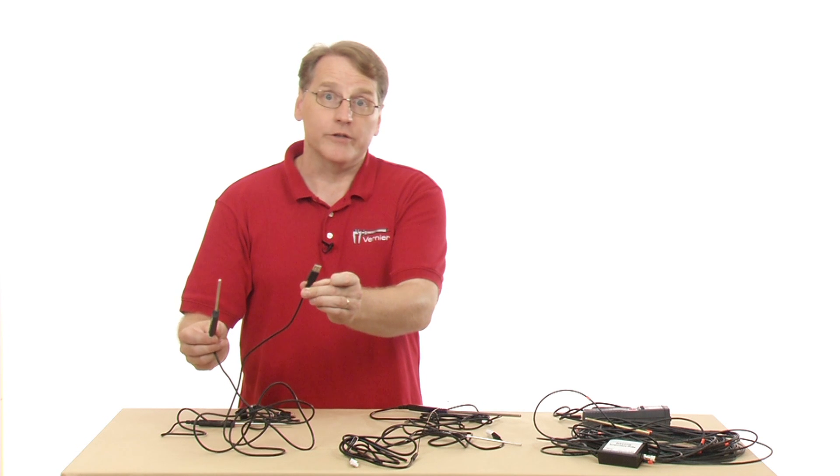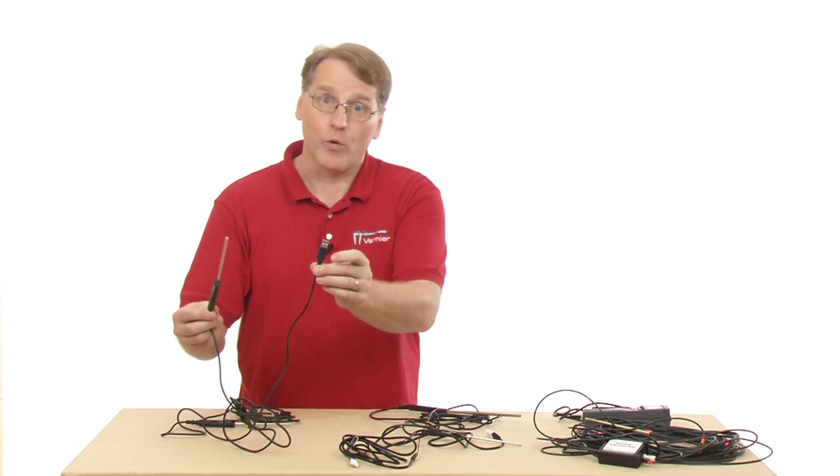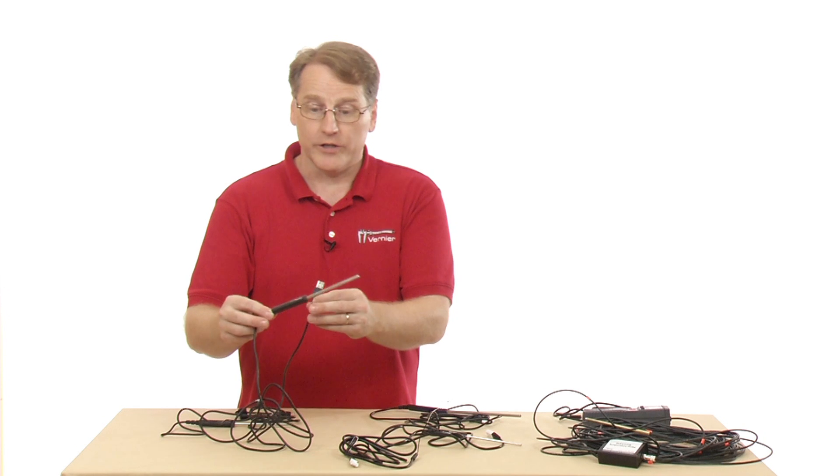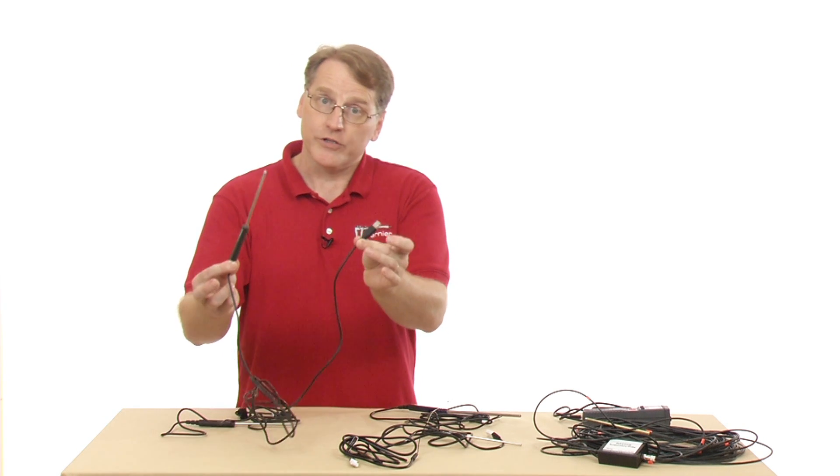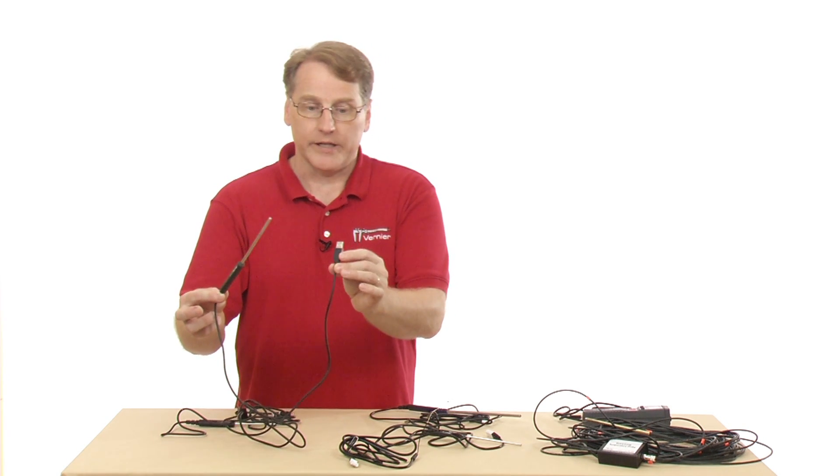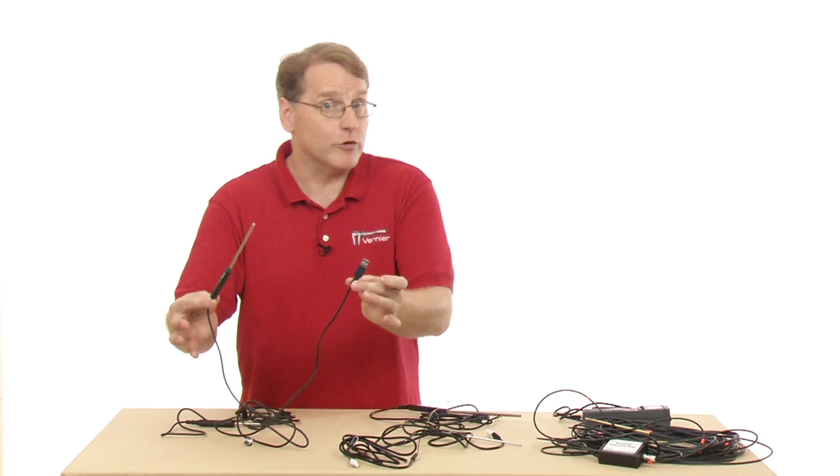This you actually plug into the computer, the USB port. And it's very similar to our stainless steel in terms of its ranges, but it just gives you that ability to do that, and it's an inexpensive way to get started if you already have a computer.